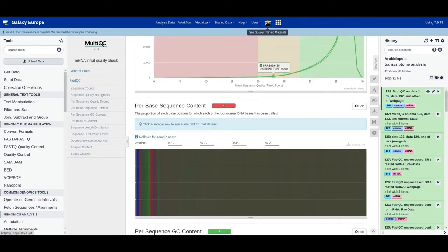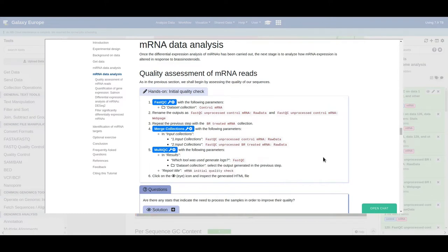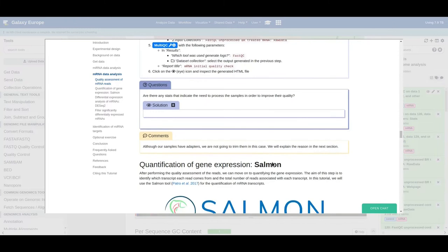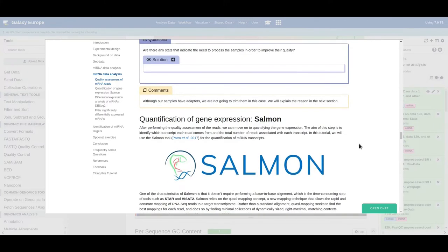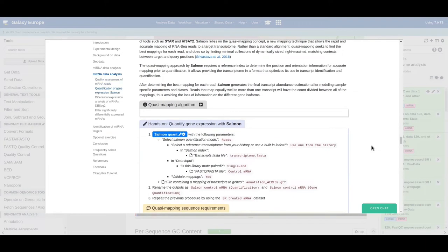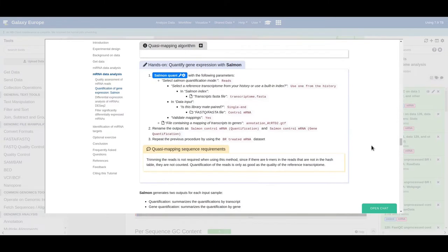Let's go back and try to answer the questions while doing your hands-on. Although there are adapters in all samples, we are not going to clip them. The main reason is the use of the Salmon tool for quantification — Salmon does simultaneous mapping and quantification without base-to-base alignment. Since k-mers corresponding to the adapters are not part of the reference transcriptome, they are not counted. Hence it's not mandatory to clip adapters when using Salmon.